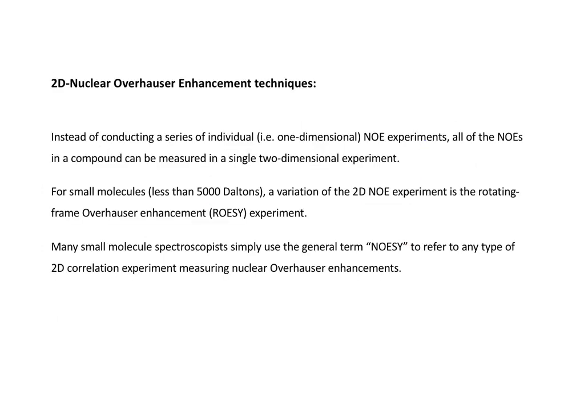The spectra that are presented in Chapter 5 are the two-dimensional NOE experiments, which are commonly known as NOESY correlation experiments. Technically, the application of two-dimensional NOE experiments with small molecules, as studied in this class, is best accomplished by a variation of the NOE experiment known as the rotating frame Overhauser enhancement experiment, or ROESY.